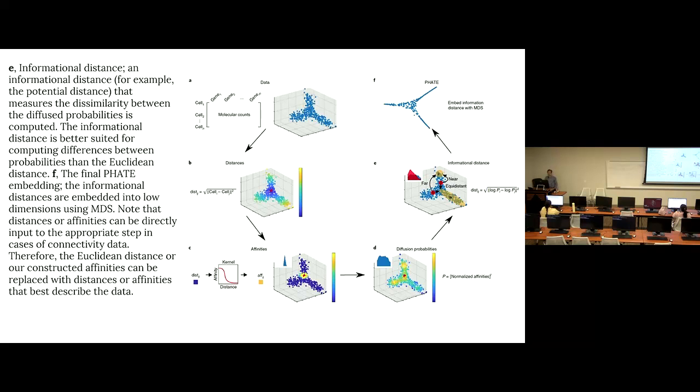It starts from the matrix of gene expression. So this is the UMI matrix. Then you compute a distance between each cell. So each point is a cell. So you can use PCA to reduce dimension, then compute the distance. It's also possible to directly compute the distance between cells.